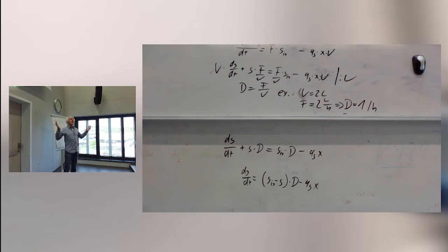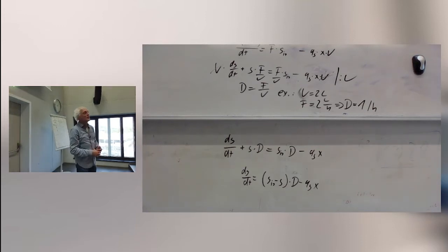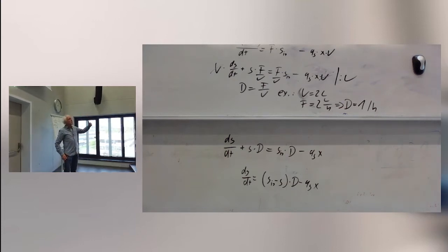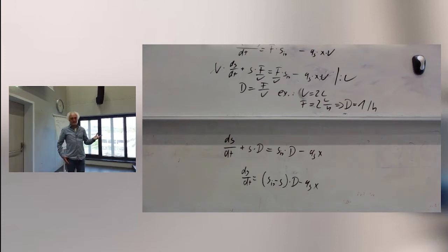So if I want to know what is a good starting point as a flow rate, if I want to achieve a constant growth, so no substrate limited growth, but an exponential growth, and I want to feed in something, you could say, what is a feed rate which makes sense?